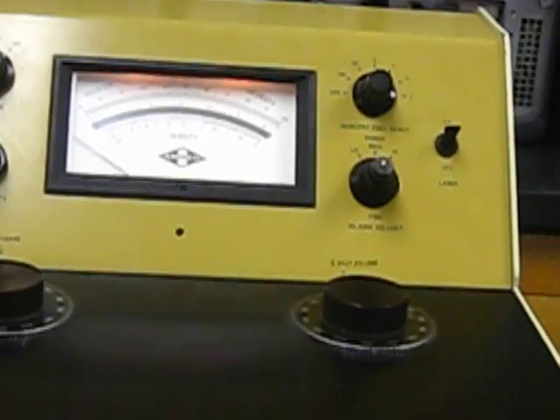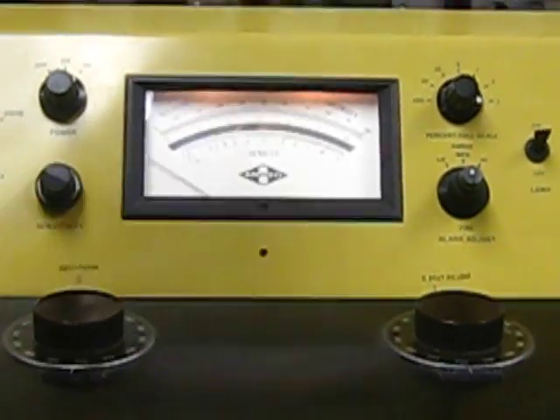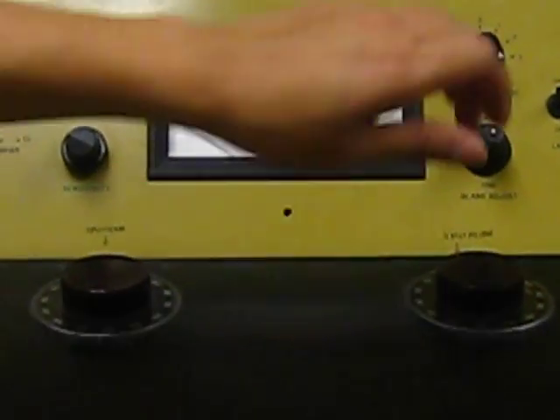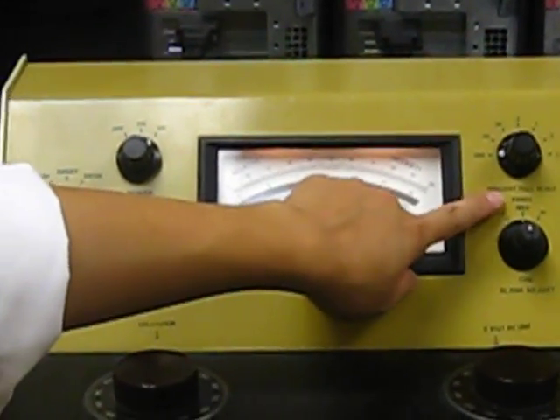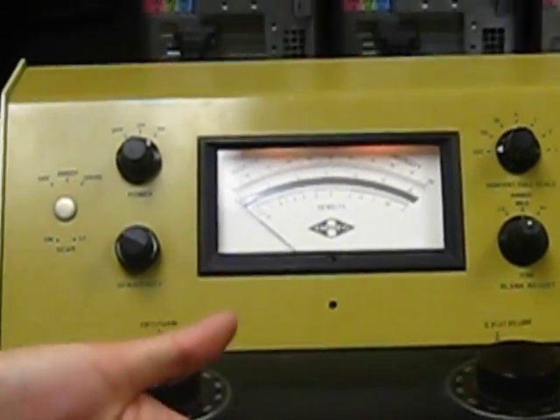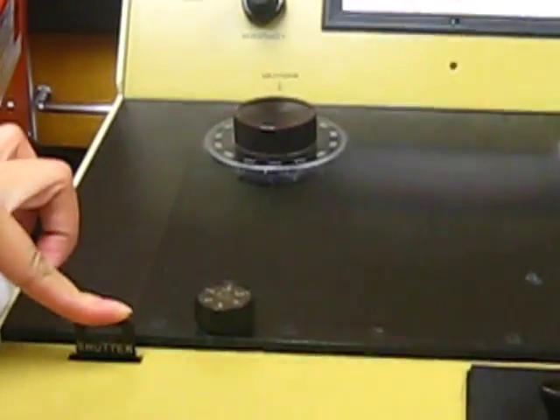Okay. First, because we already set up the 0 with the blank, now with the very first sample, we need to close the shutter and put the percent full scale to 100 because we don't know how strong it is. So we close the shutter.